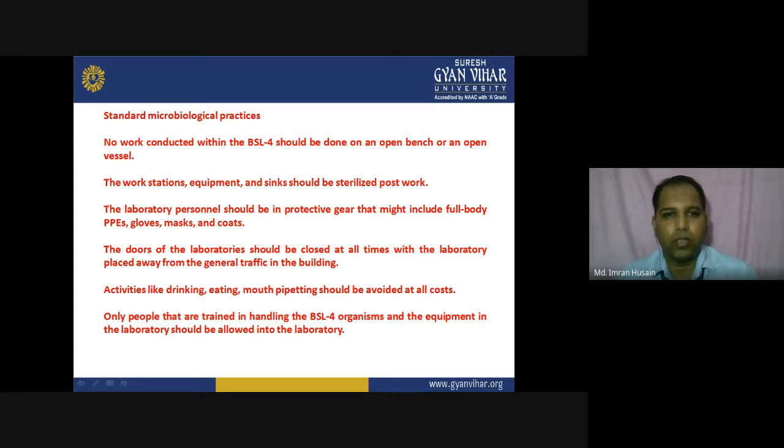So, standard microbiological practices implemented in BSL-4. No work conducted within the BSL-4 should be done on an open bench or an open vessel. The workstations, equipment, and sinks should be sterilized post-work. Every time, the laboratory personnel should be in protective gear that might include full body PPE, gloves, masks, and coats. Full body protection measures should always be adopted.